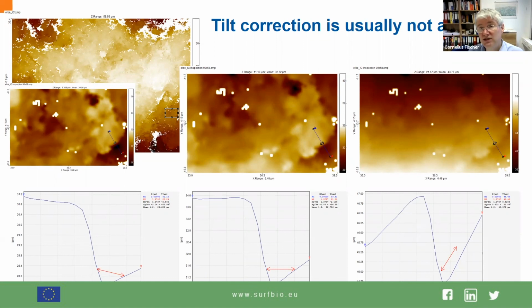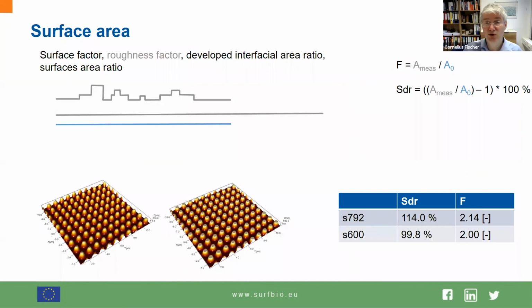What usually is done, there's a good motivation for that. If you would rotate your data set, you would come up with a grid with your pixel size that would vary. You cannot do that because that's too difficult to handle with most software that is available for that. So it's still a simple projection. That's something you should keep in mind.